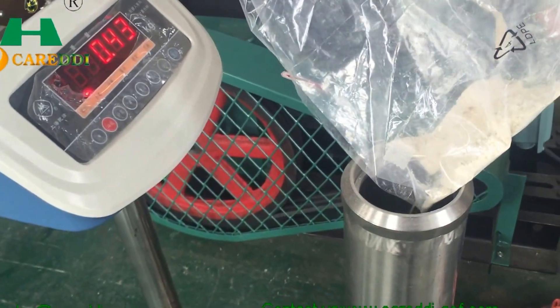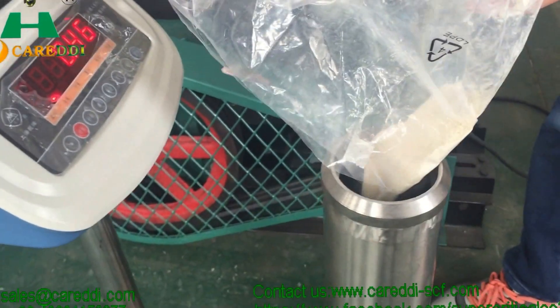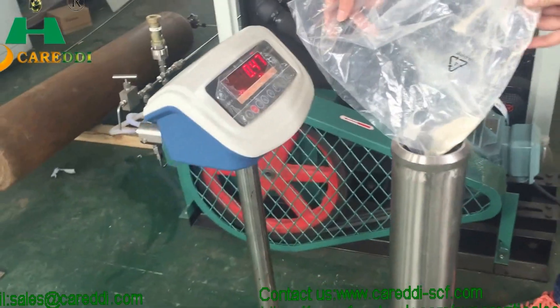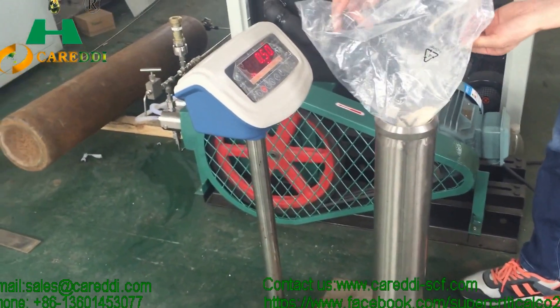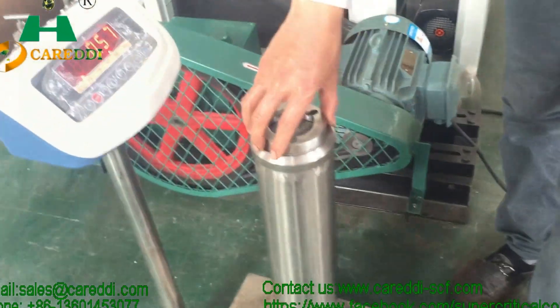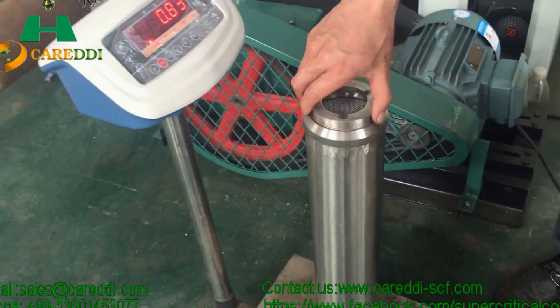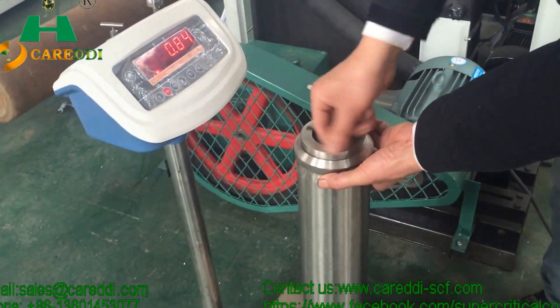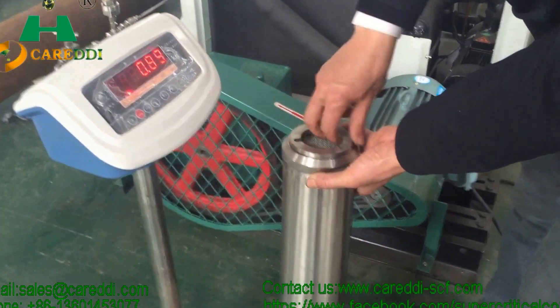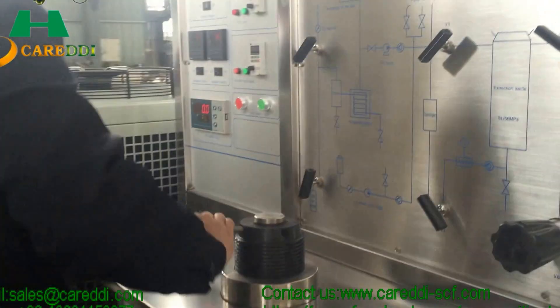Now we are loading the frankincense milk powder into the material tank before the extraction. The weight of the material is about 500 grams. Close the cover of the material tank — this material tank is to be put inside the extraction tank.